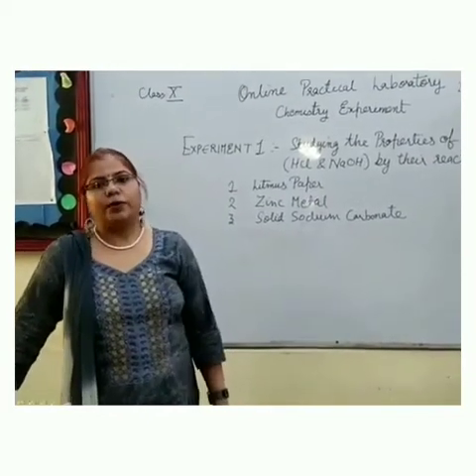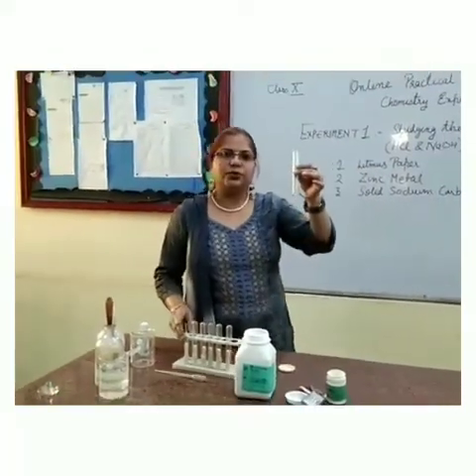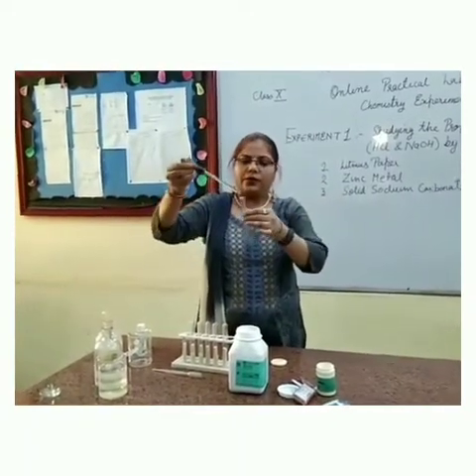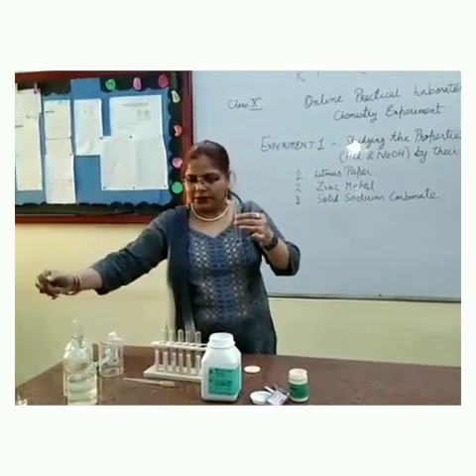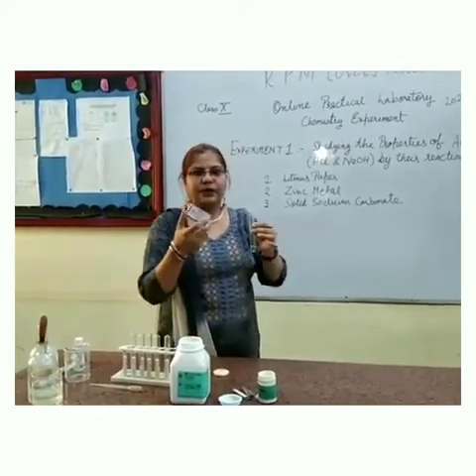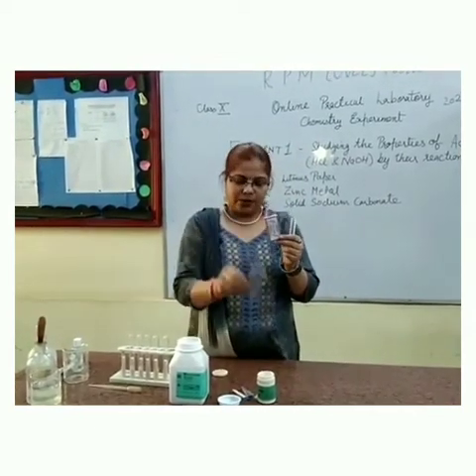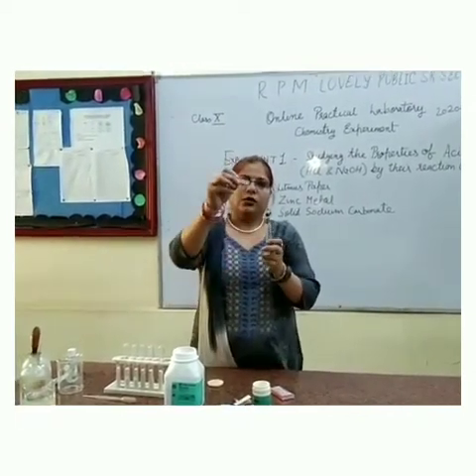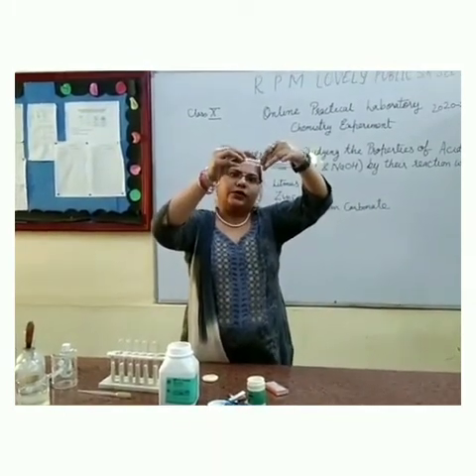Here we have to check the properties of acid and base. First of all, we take a test tube, and with the help of a dropper, we will add a few drops of hydrochloric acid. Now we will take litmus paper — we have two litmus papers: red litmus paper and blue litmus paper. We will put a small paper strip in this test tube to check what change occurs.